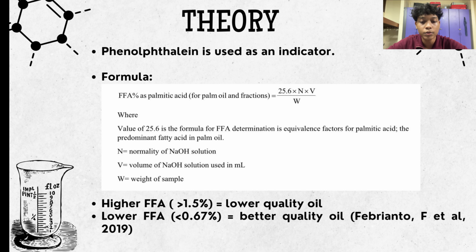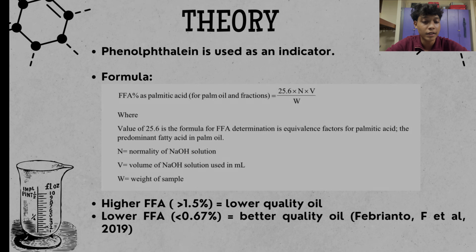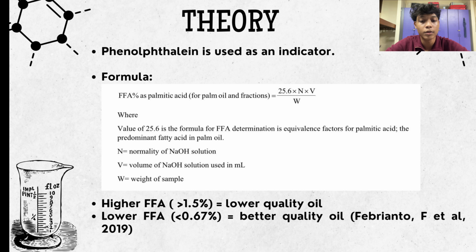Next, we use this formula to calculate FFA. If the FFA value is below 0.67%, the oil is considered fresh and of good quality. However, if the FFA value is above 1.5%, it means the oil has deteriorated and its quality is much lower.